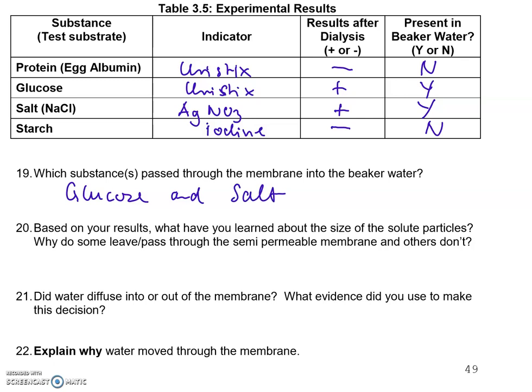Based on your results, what have you learned about the size of the solute particles? Well, we have learned that glucose and salt are small enough to leave the dialysis bags through the semi-permeable dialysis membrane, versus protein and starch are too large. They cannot come out, and so therefore we didn't find them in the beaker water.